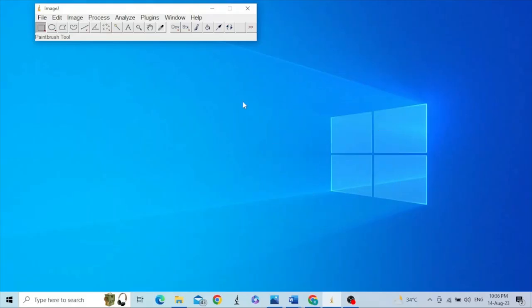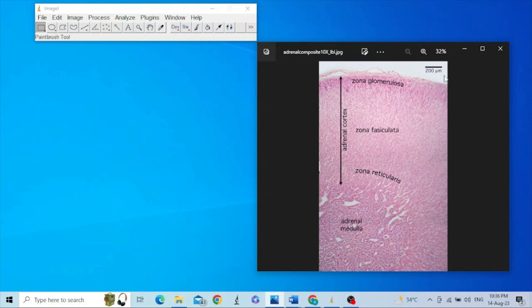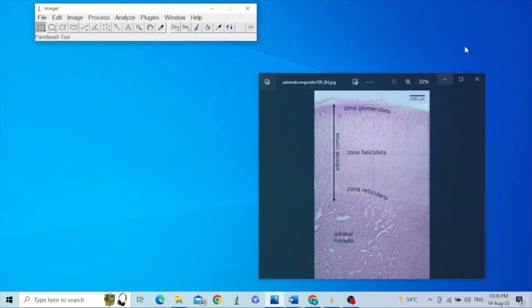Hello friends, today we will talk about annotation of an image in ImageJ software. You might have seen images or figures where the adrenal gland has been labeled — for example, adrenal medulla, adrenal cortex shown with a double-headed arrow, and different parts of the adrenal cortex labeled like zona reticularis, zona fasciculata, and zona glomerulosa. We can also label our image in ImageJ software; this process is called annotation.